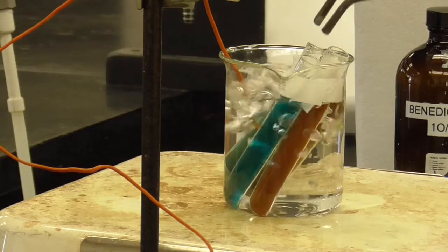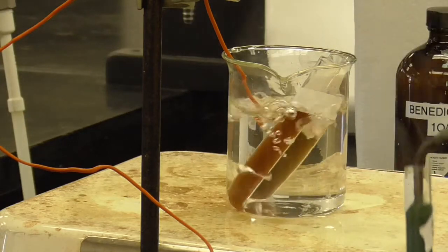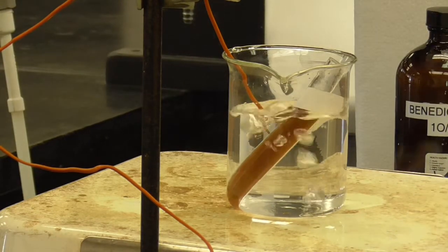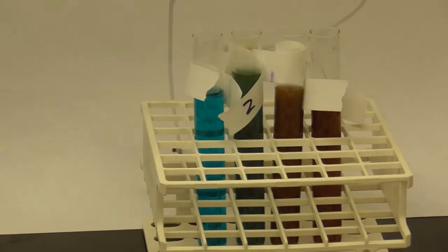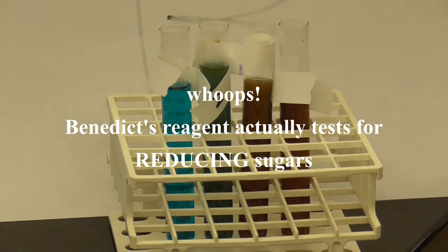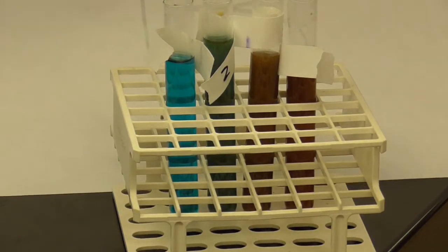Okay, so if I'm looking at these labels correctly, they're starting to come off the test tubes, but this is number 1. Test tube number 1. This one is number 2. Here's number 3. And number 4. Okay, and maybe if I hold up a white paper behind it, you can see the different colors representing whether we have non-reducing sugars. And again, starch is a non-reducing sugar, whereas the glucose down here are reducing sugars. And so you see the difference as to whether or not starch has been broken up by our amylase.